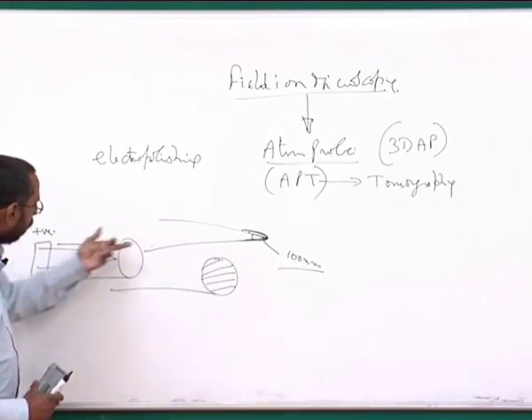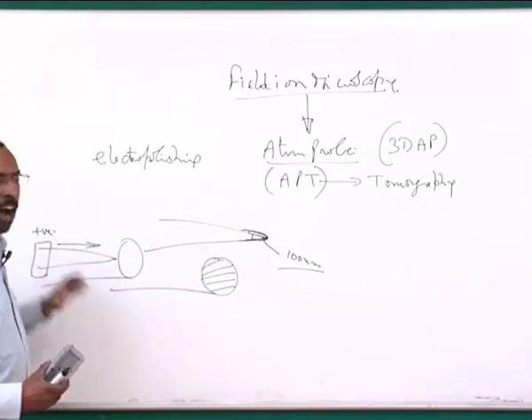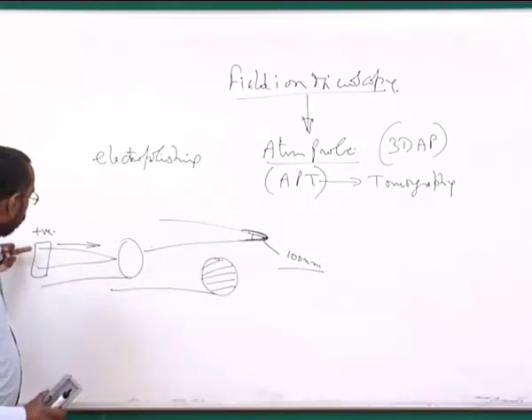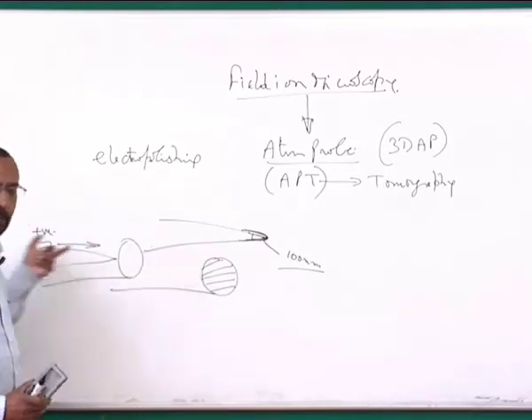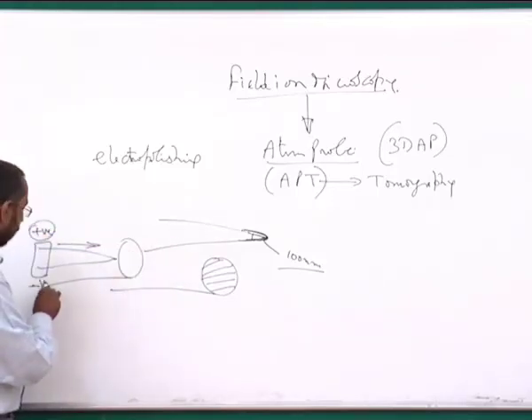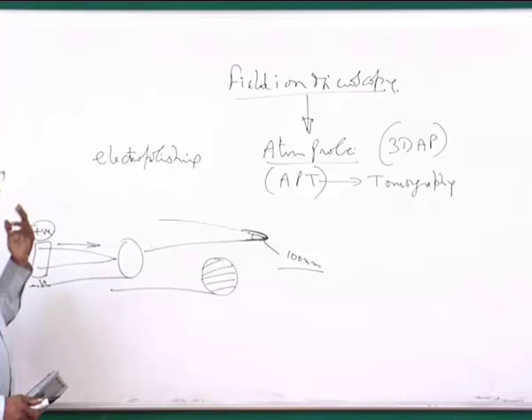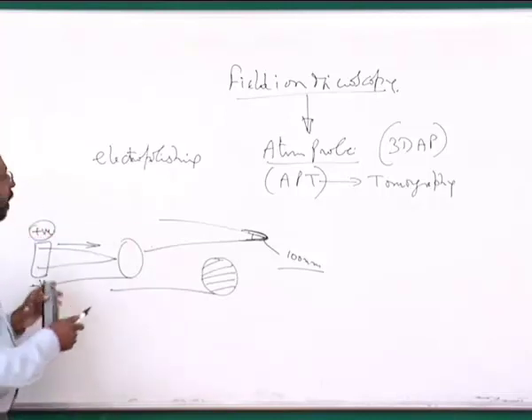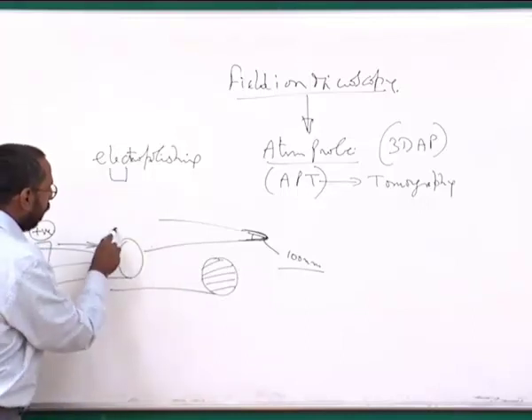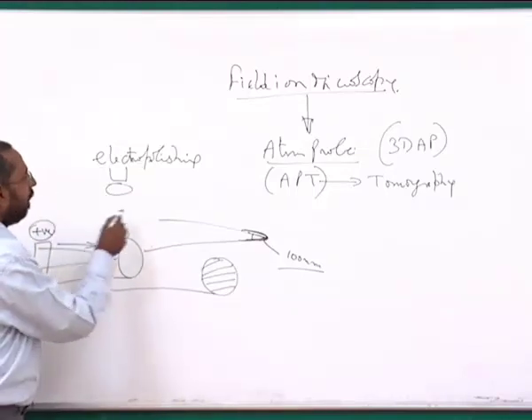On an optical microscope, we have a way to move our sample. So if you fix this on the optical microscope, you can move this while keeping the electrolyte stationary, so that the needle goes in and comes out, and in the process it keeps getting dissolved, because this is made positive and this is made negative. As a result, the same kind of jet electropolishing that we talked about in the case of TEM can happen here. You keep this whole thing in an optical microscope so that you keep observing using an objective lens and an eyepiece, and this is what we call a stereo microscope.